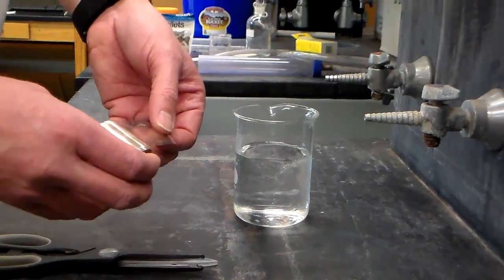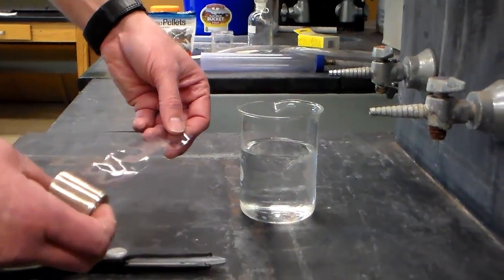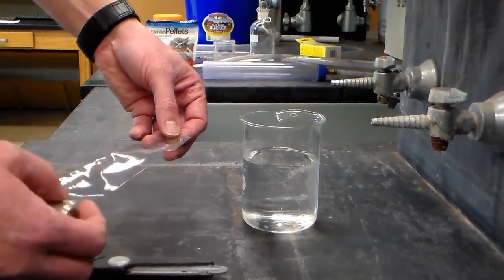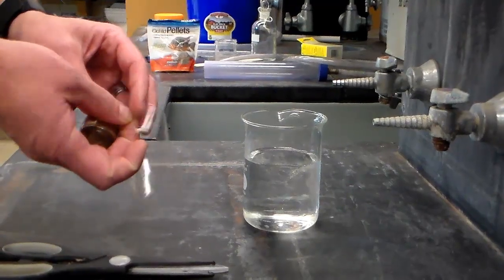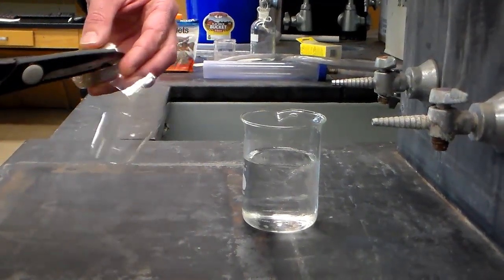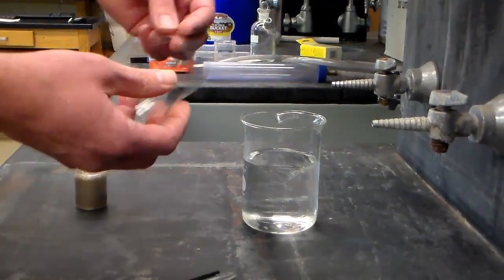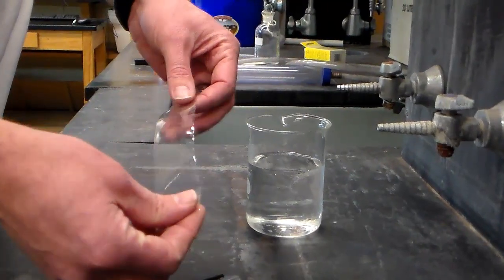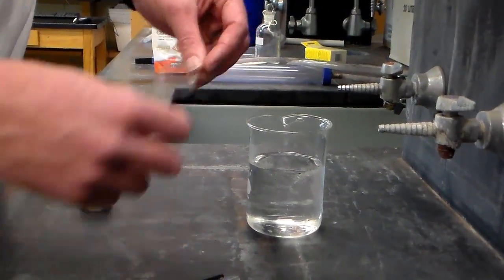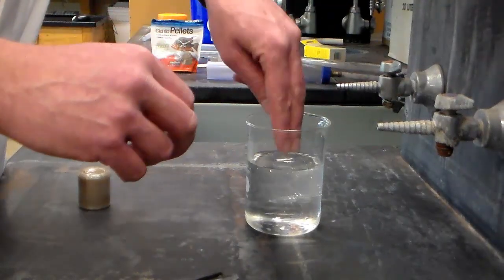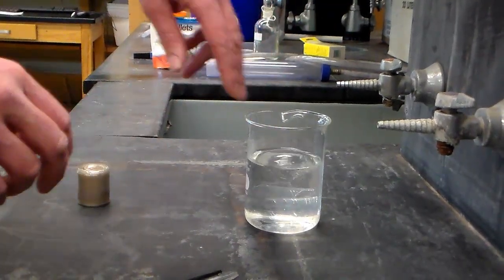Okay, so this is dialysis tubing. We want to pull off 20 centimeters or so and cut it. Now when it's dry it's not very useful, so then put it in distilled water and let it soak for about five minutes.